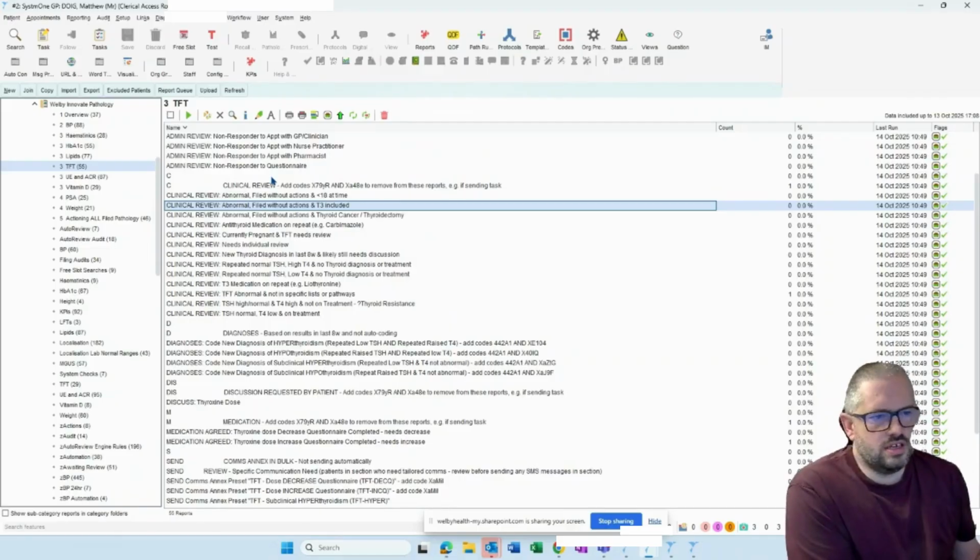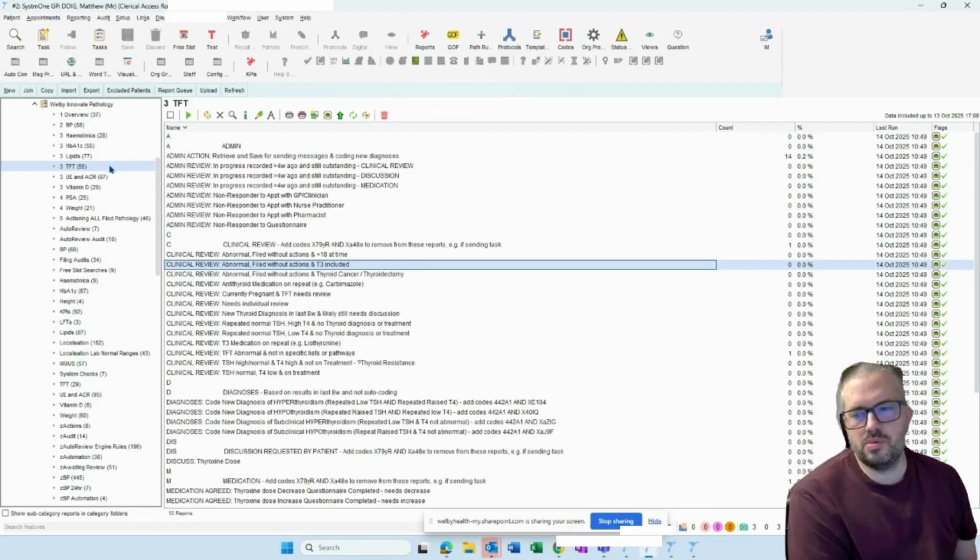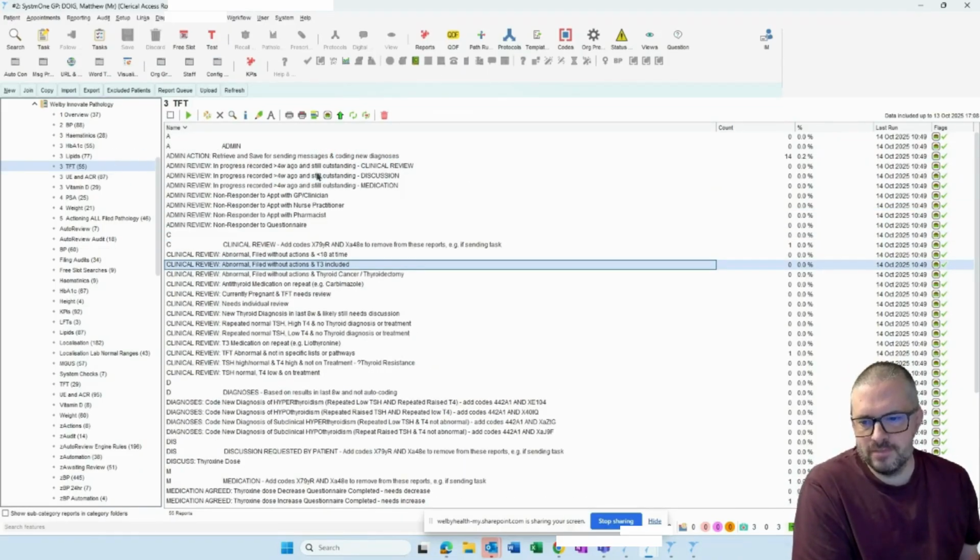Hi there. This is a look at our TFT reports as part of our pathology system.